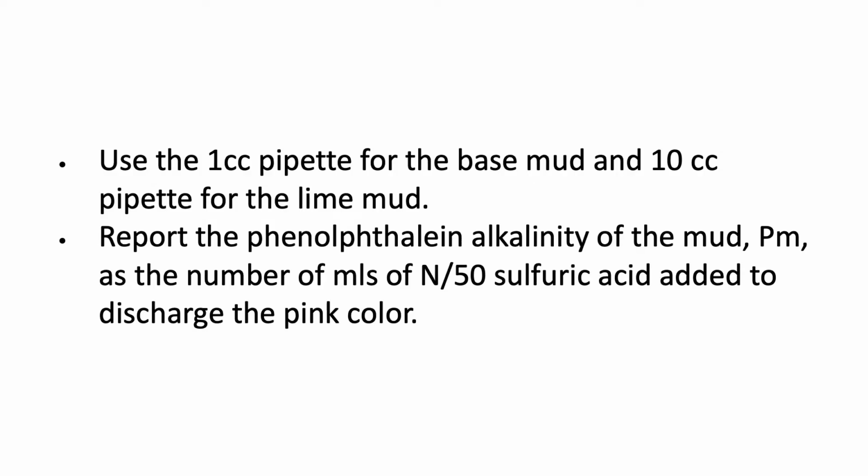Use the 1 cc pipette for the base mud and the 10 cc pipette for the lime mud later in the experiment. Report the phenolphthalein alkalinity of the mud, PM, as the number of milliliters of the N/50 sulfuric acid added to discharge the pink color.